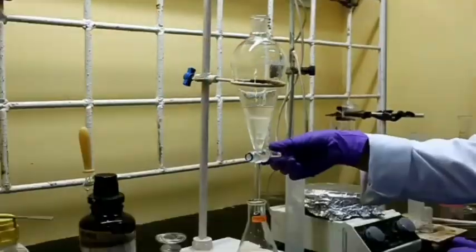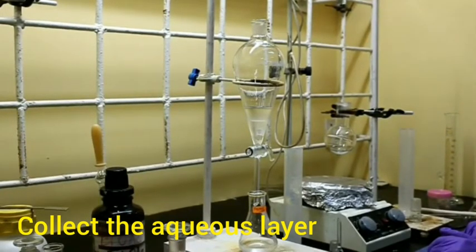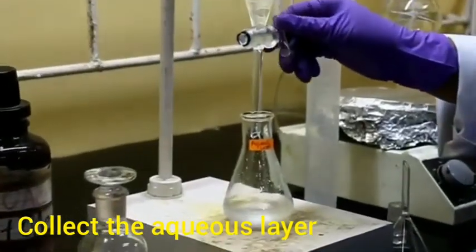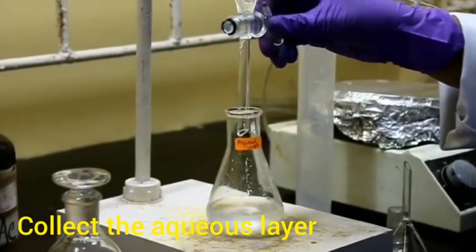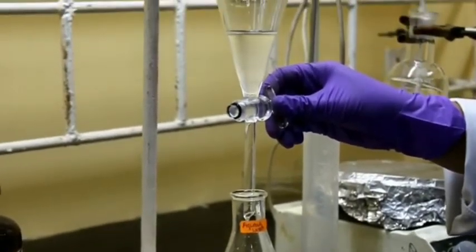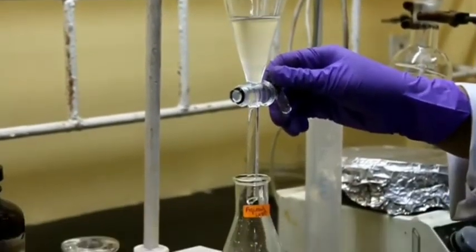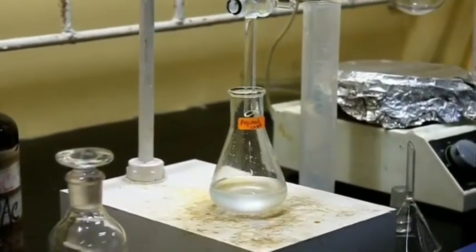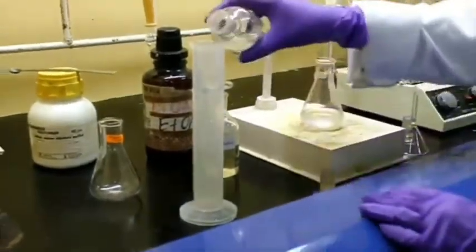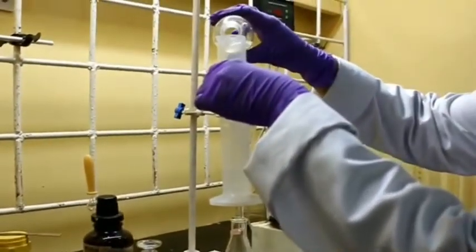Wait for the two layers to separate. Now collect the aqueous layer. We are repeating the bicarbonate wash part. We are measuring 20 ml of sodium bicarbonate solution.